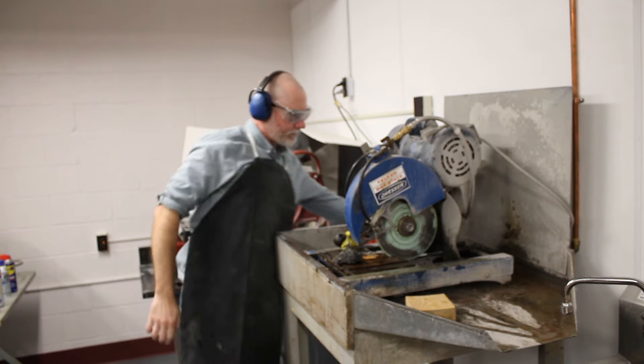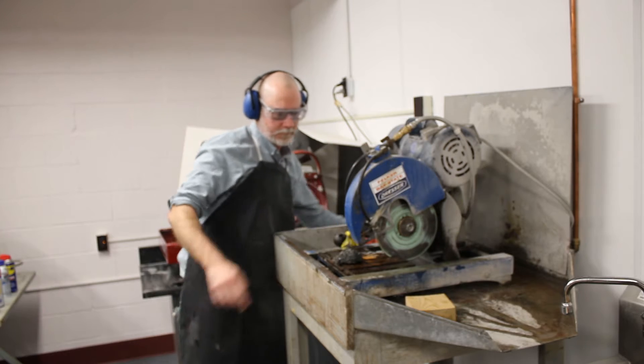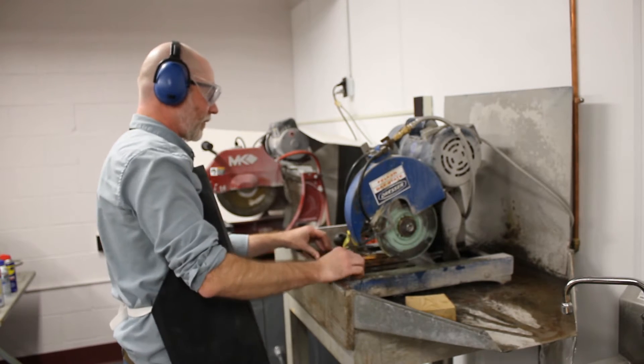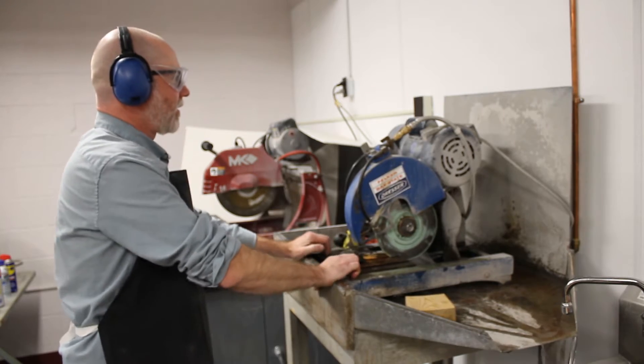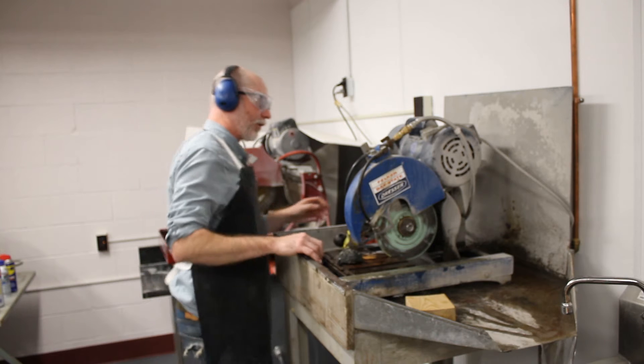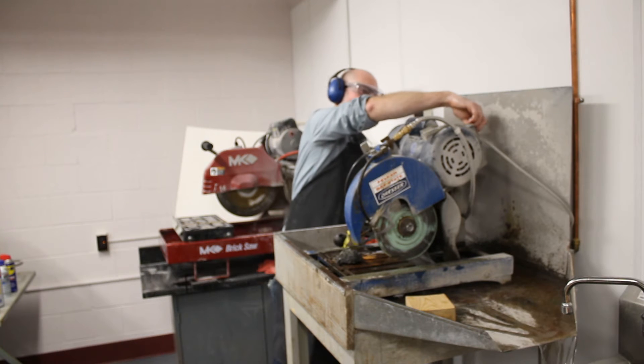These are water-cooled, so we have to initially turn on the water. All right, we're going to turn on the saw.